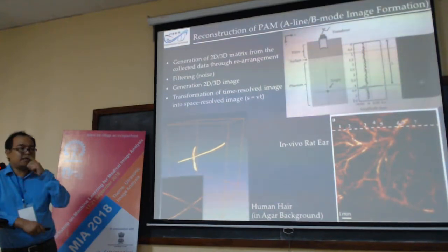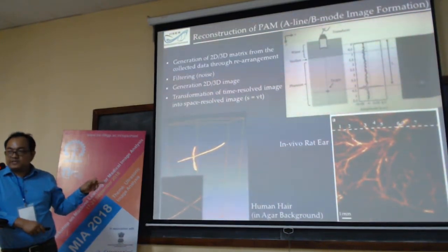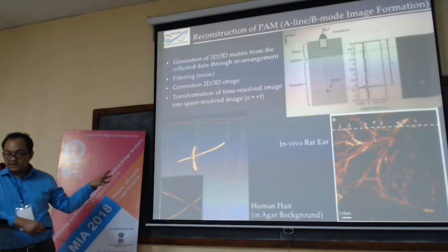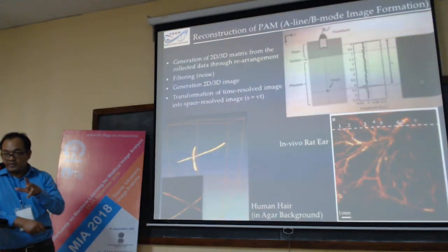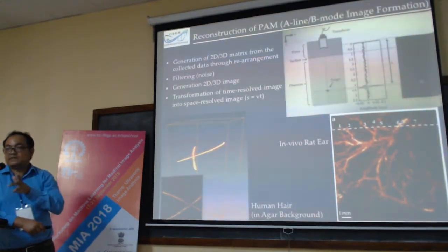It's very interesting. So in this way, though the microscopy is very promising, what about real-time imaging? That is what people are looking for. Basically, I didn't include that part. But people have achieved real time. Instead of mechanical movement, people move and scan electronically, so we can achieve real time.